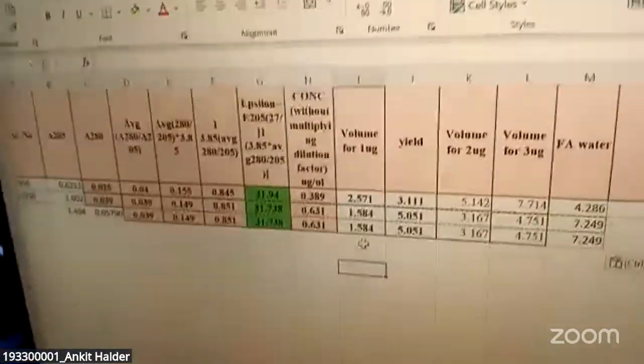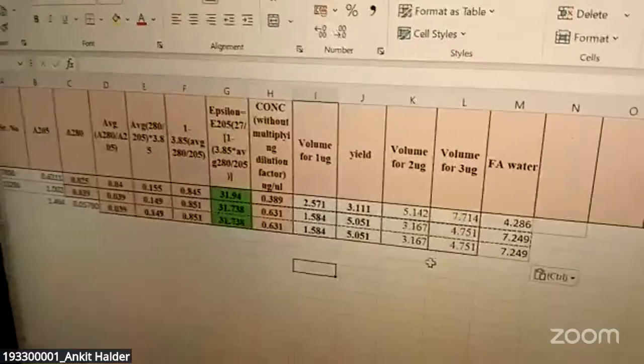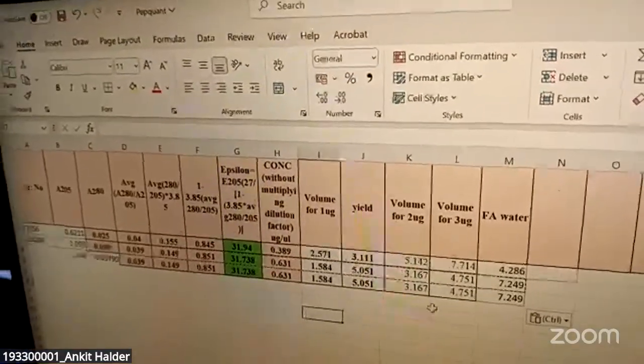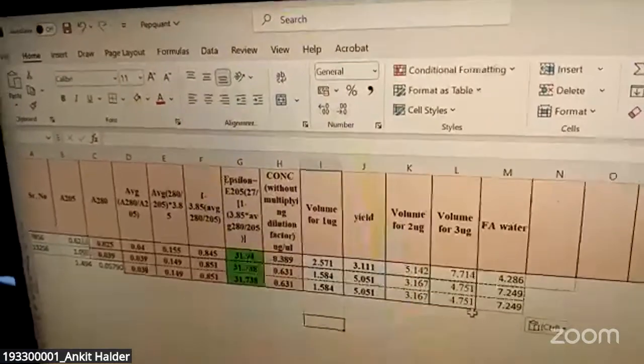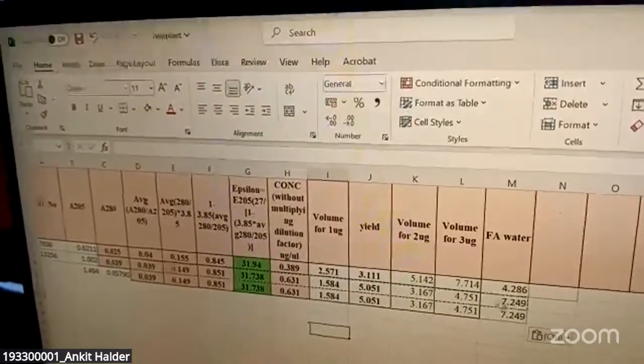per microliter. Now if we talk about Orbitrap Fusion, for global proteomics we need at least 1 microgram of peptide. For safer purposes, we generally give the machine 3 micrograms of peptide sample, and we also make up the volume with the help of FA.